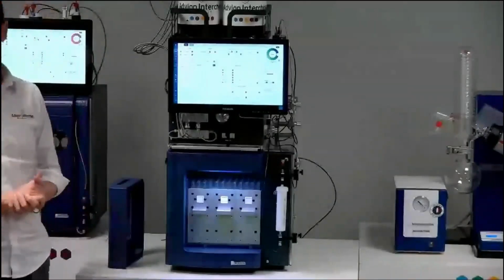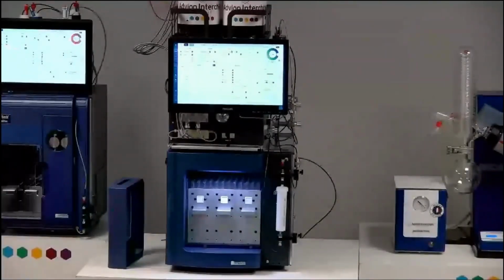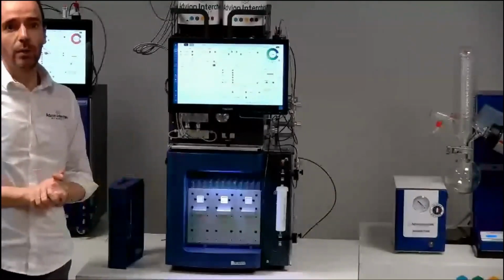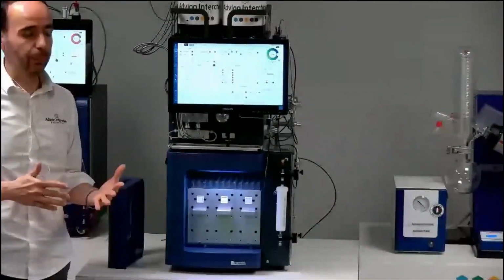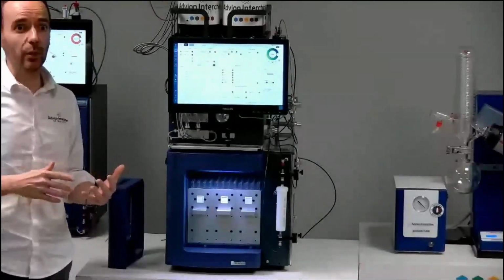How do you collect the samples after separation because you want to purify them? So all is managed with the software. On the software, you can decide how to collect the product from which signal.